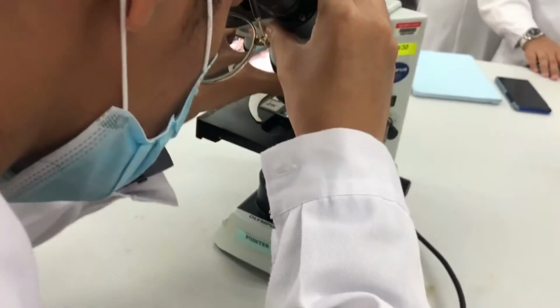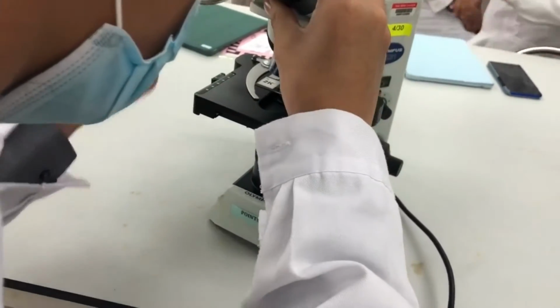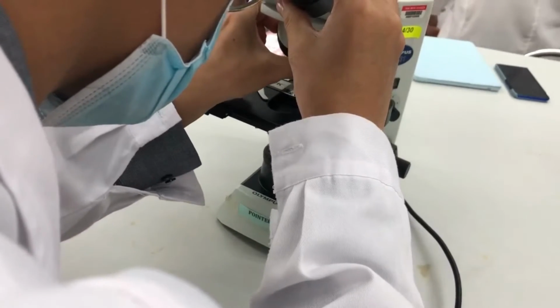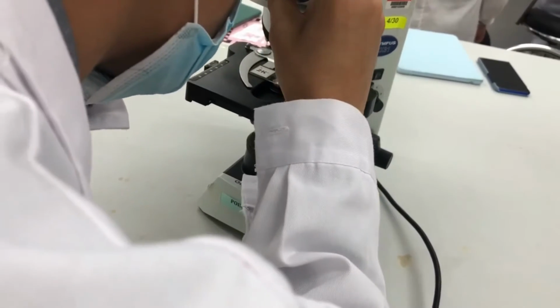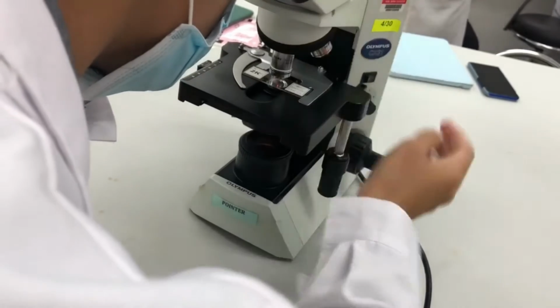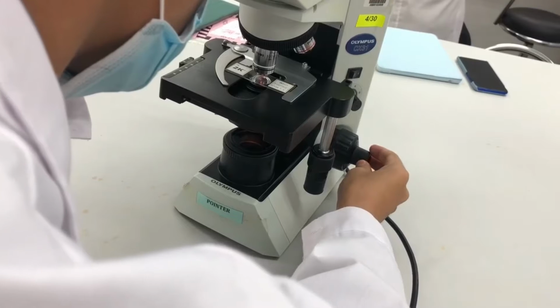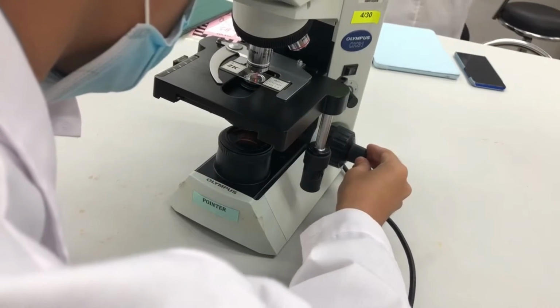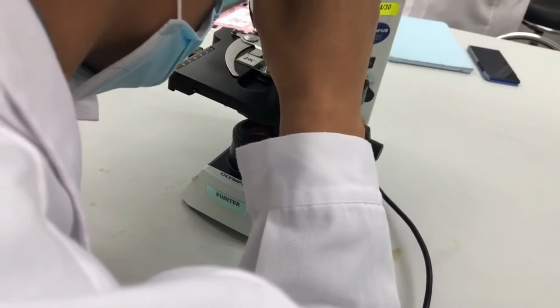First, rotate the nosepiece to bring the high power objective lens, 40 magnification, halfway. Then, while holding the nosepiece, add one drop of immersion oil to the illuminated spot on the slide. Then, rotate the nosepiece again to move the high power objective lens, 100 magnification, into position until hearing a clicking sound. And lastly, while looking at the specimen through the ocular lens, use the fine adjustment knob to get a sharp focus and clear image of the specimen.